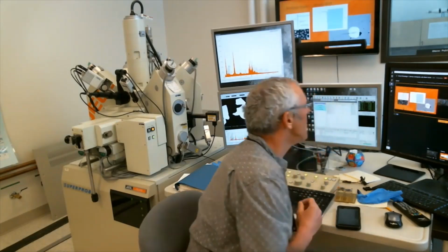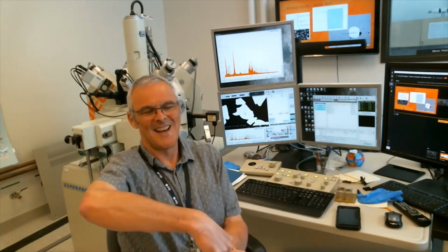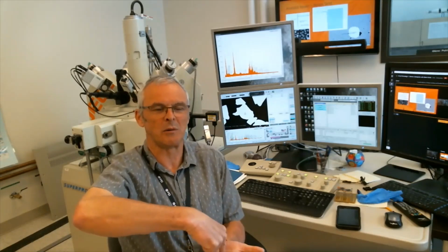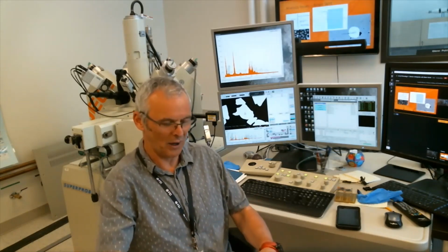So one of the things that we're working with low vacuum mode, and that's very bad, very tricky to work around, is that we get what's called a beam skirt effect. An electron beam is coming down, and say 90% of that beam is actually landing on the sample in that point where we want it to land. But because we are working in an atmosphere, some of that beam gets scattered around that point.